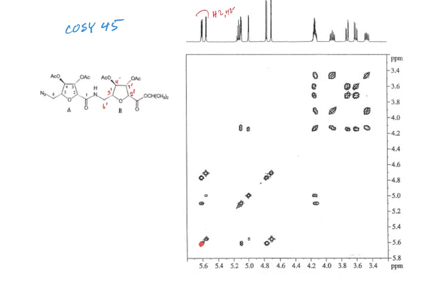So remember that when we have a hydrogen here, if we have just an OH or an ether versus an ester, the ester one actually is more downfield. Okay, so I was wrong. These are not actually the H2s. They're going to be one of these next to an acetate, so either 3 or 4.